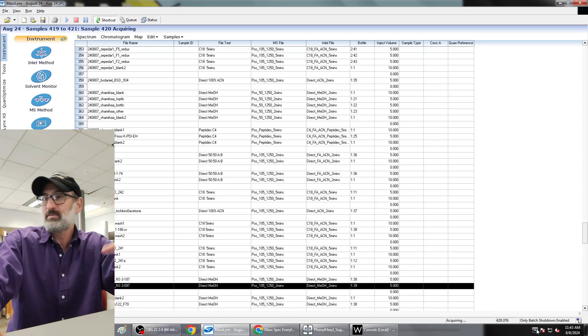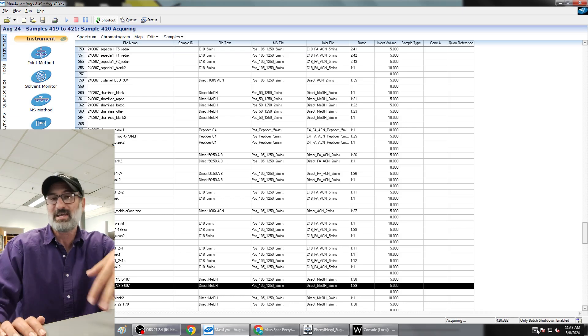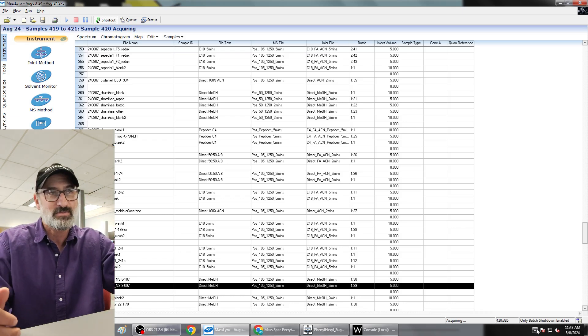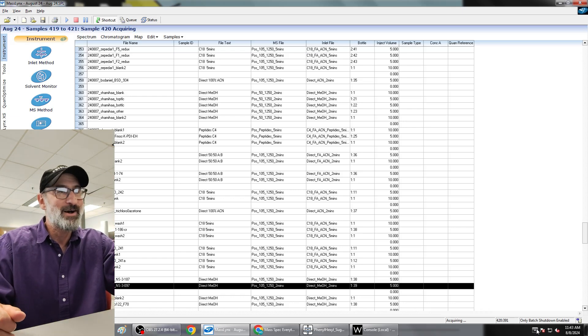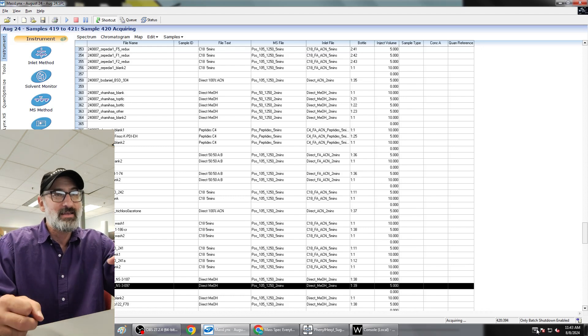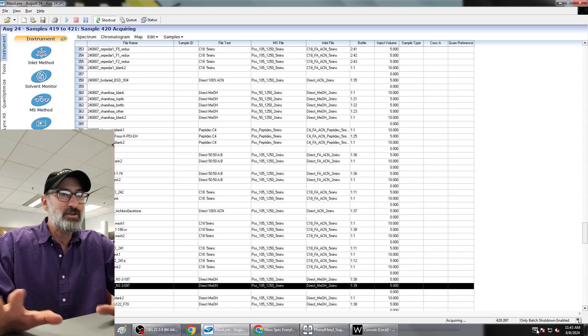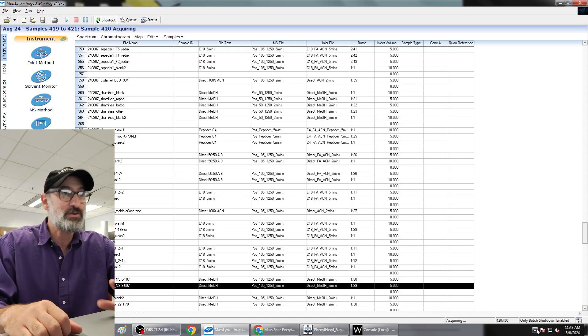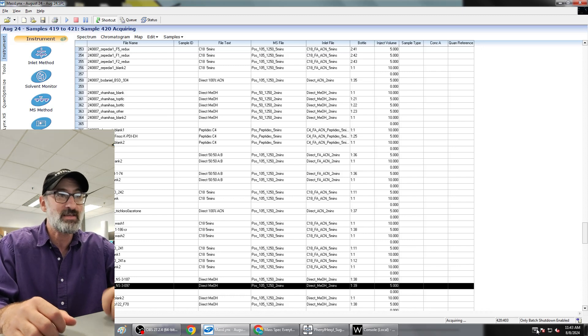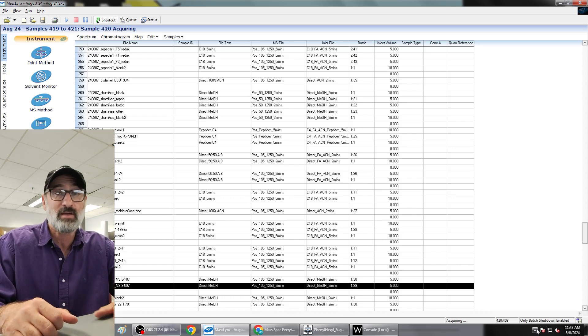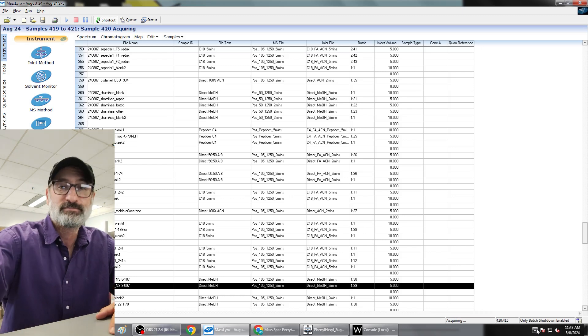The only time you ever encounter problems is if you try to submit a run during the shutdown cycle. Very rarely happens, but it could happen. But yeah, so if you do that, you'll make it so your system has a lot fewer stop flow errors than doing it manually. So typically I'd recommend using this turn-on, turn-off automatic method.